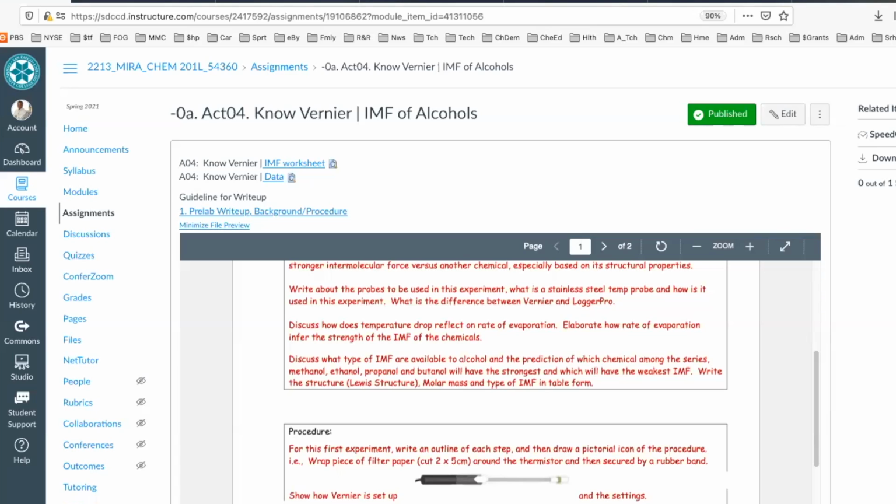One will give you a reading. The second might be higher or lower than that. But if it's really low, then the third one really gives you information as to where to bias your readings. It might be closer to the first, might be closer to the second, or it might be in between. But then what you can do is take an average, and then you can look at those three data points that you have and compare it to the average. You can't do that with two data points. You can do it with three, but not two. What happens is that you can take the average of the three, look at the first one, see how far that deviates from the average.